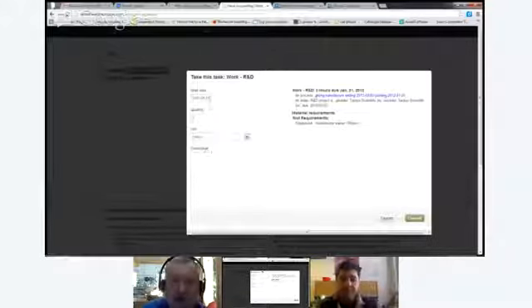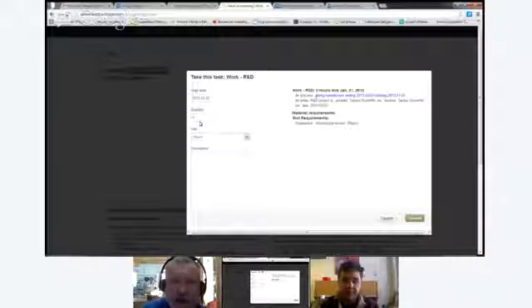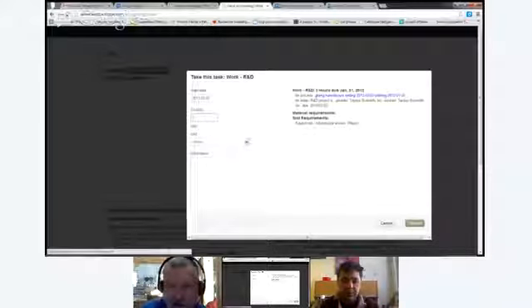All right, and that will change the start time of the process, because this is when you're actually going to start working on it, or when you say you're going to start working on it anyway. So I say I start tomorrow, and you can just leave all that the same, and then just click the commit button, and then it'll show up in your work in process with a lab notes button. Okay. Yeah. So I commit.